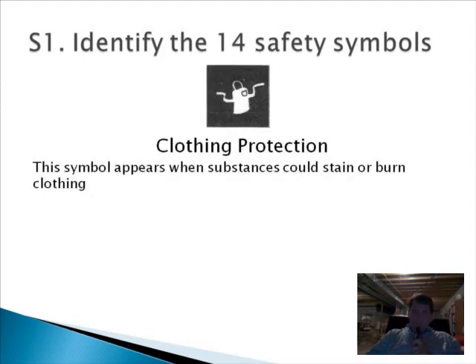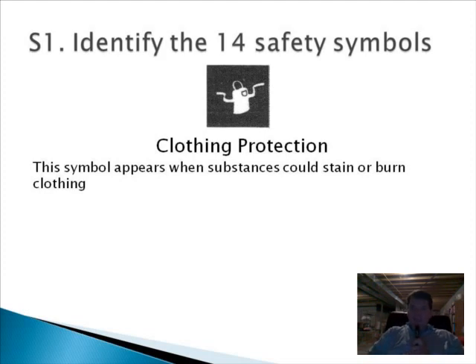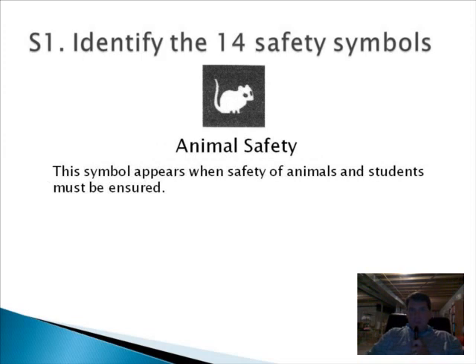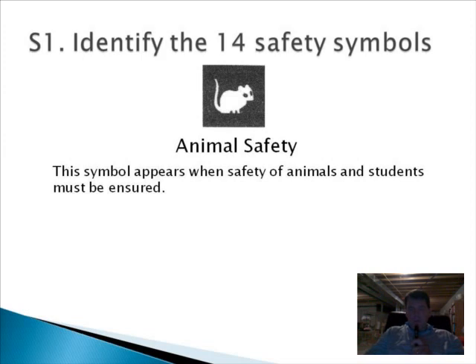Clothing protection is exactly what it sounds like. Many chemicals will stain or burn through clothing and then be stuck to your skin, so wearing a lab apron is just another layer of defense against chemicals. If you have any class animals or are working with animals, the animal safety symbol is important — not only for your own safety but also for the safety of the animal.